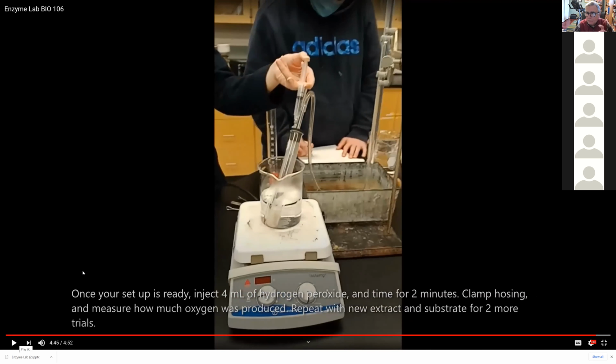Okay, here's the setup. So here's the enzyme extract down here. Here's the substrate, the hydrogen peroxide. She's about to inject it into the enzyme extract. And what's going to happen? You're going to make water and oxygen. The oxygen will travel up the reaction vessel, into this tube, down through here, and up into the eudiometer. And so the water level in the eudiometer will drop depending upon how much oxygen is going into it. All right. So you're collecting the oxygen in the eudiometer.